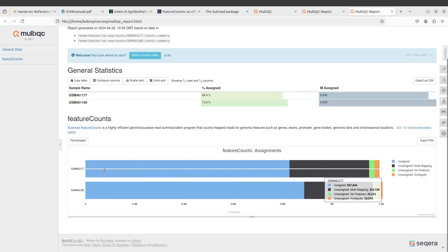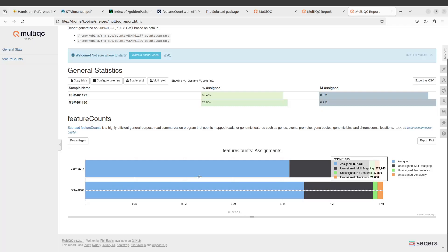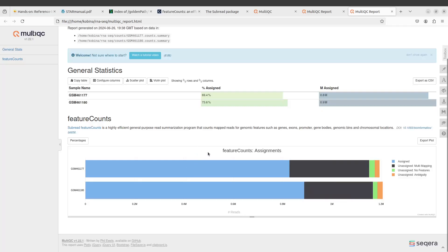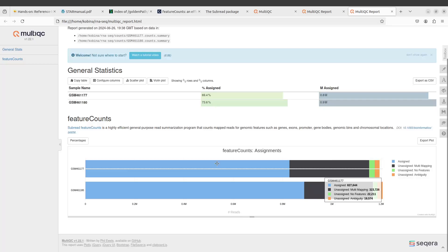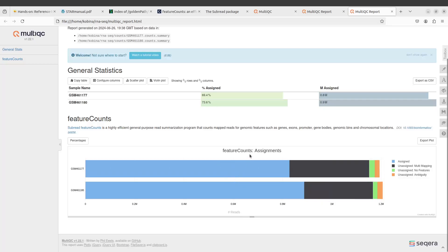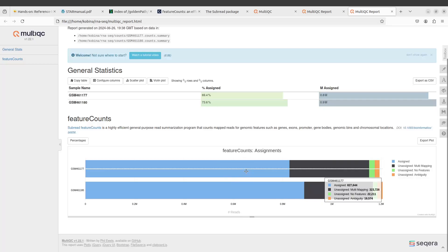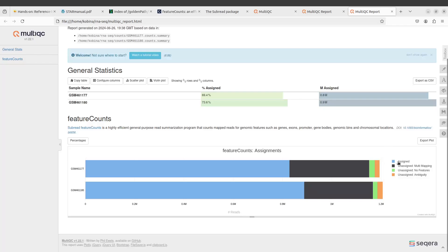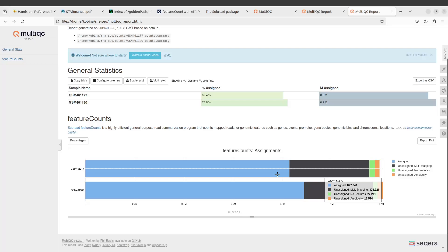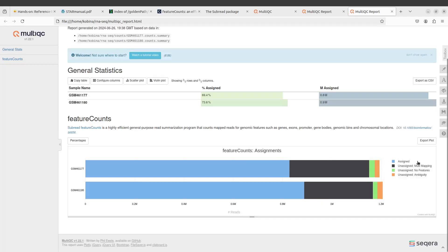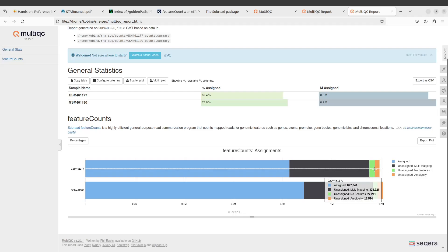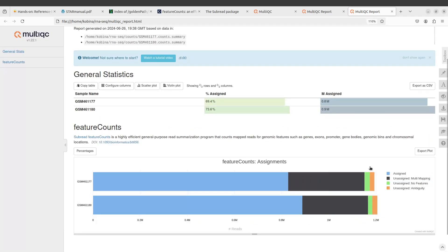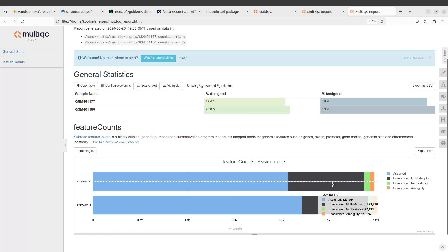When I open it, I'm going to see my reports. I have my two samples — 461177 and 461180. There's a bar chart showing the results.